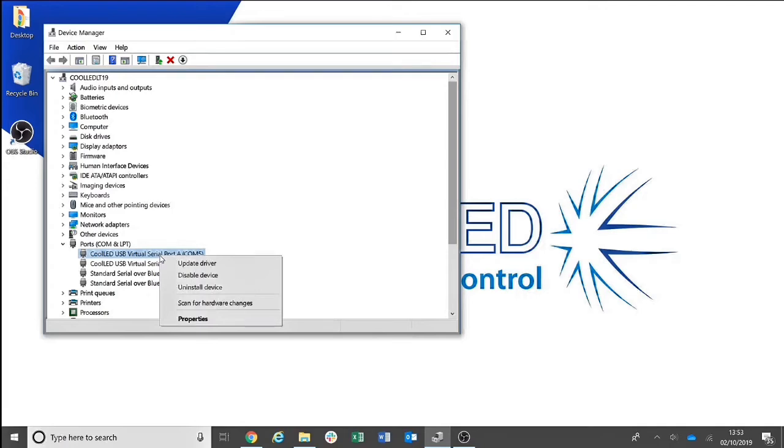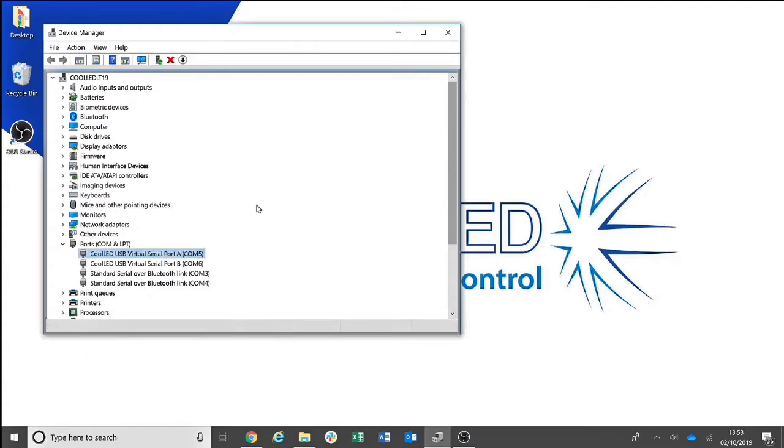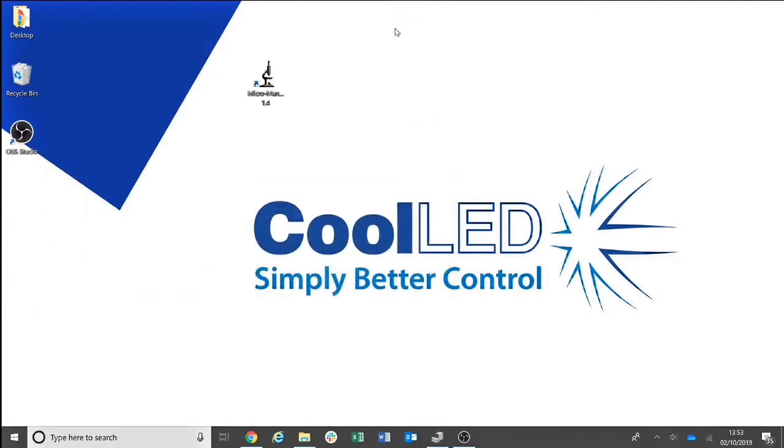If you have any problems, you can right click and update the driver and direct the CoolLED light source to the drivers saved to your memorable place. Once correctly installed, you can then open Micromanager.